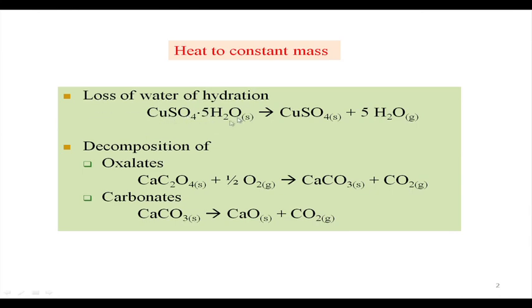So, this one will immediately show some color change for the monohydrate formation, and then the monohydrate will ultimately go to the anhydrous form of copper sulphate. The temperature ranges known to us for the formation of monohydrate copper sulphate and the corresponding anhydrous copper sulphate are important, because some of these samples are very useful. Even in small amounts, they can show some catalytic activity in any organic transformation, biochemical transformation, or any pharmaceutical preparation. We can use 3 different types of copper sulphate therefore.